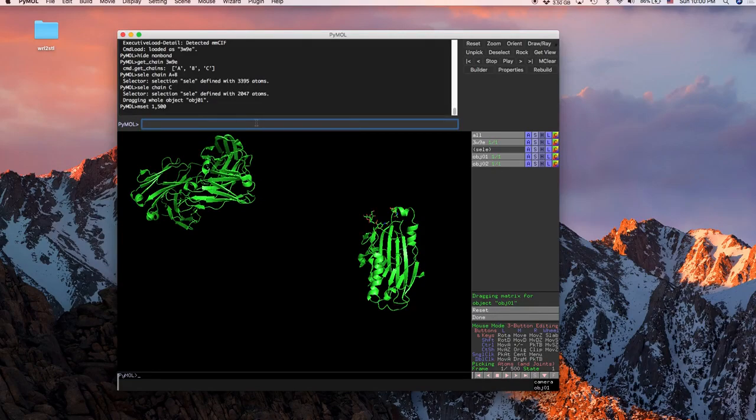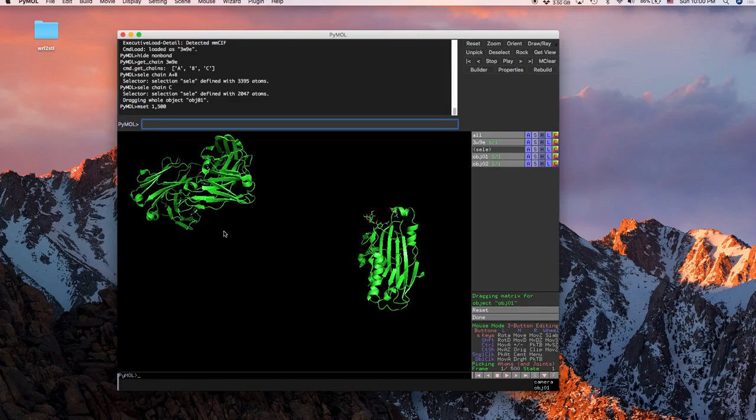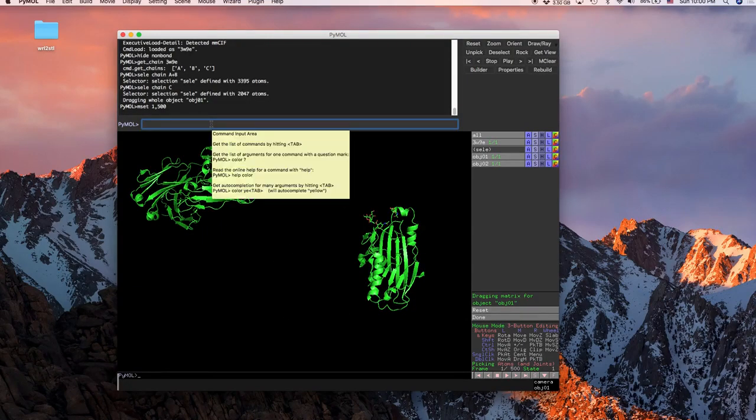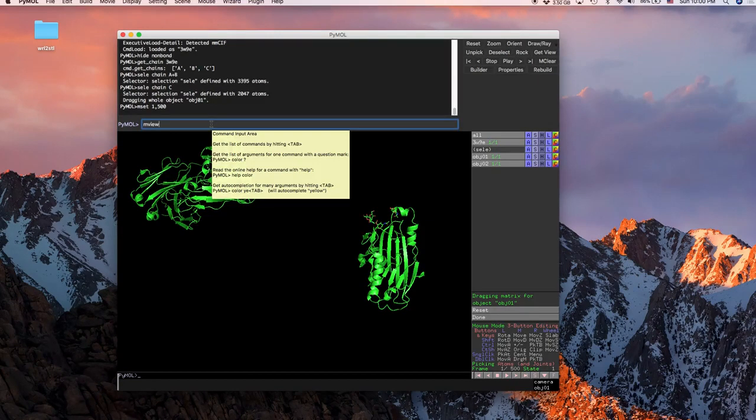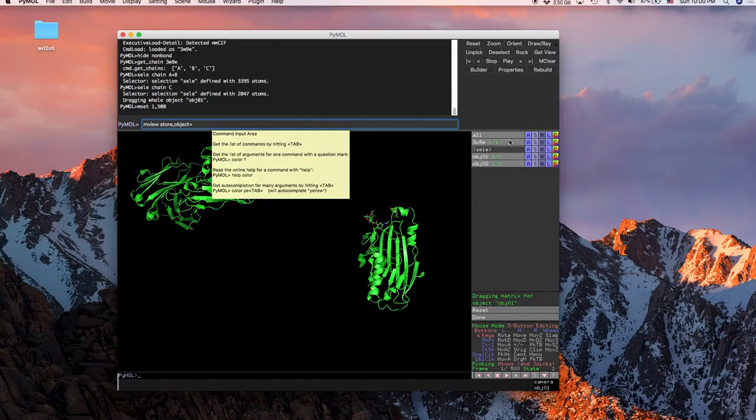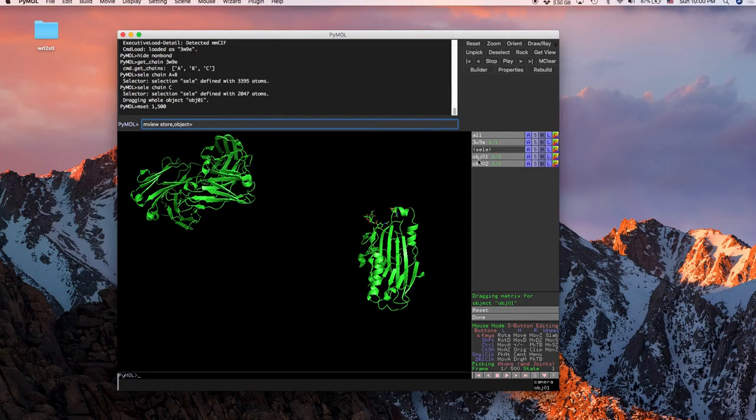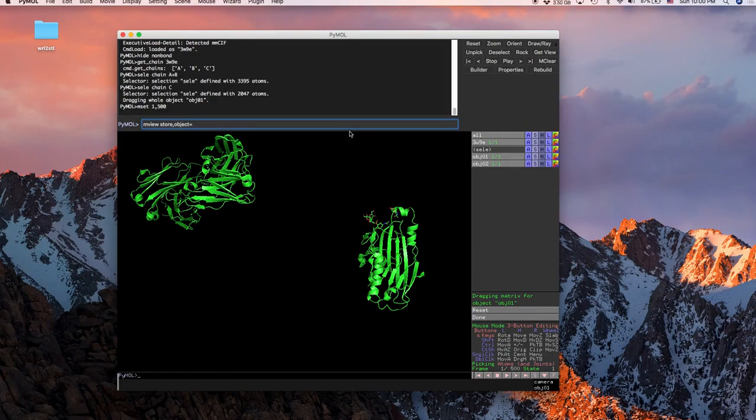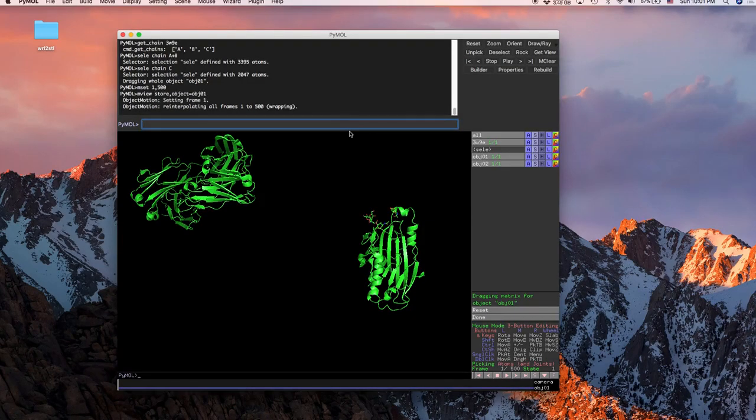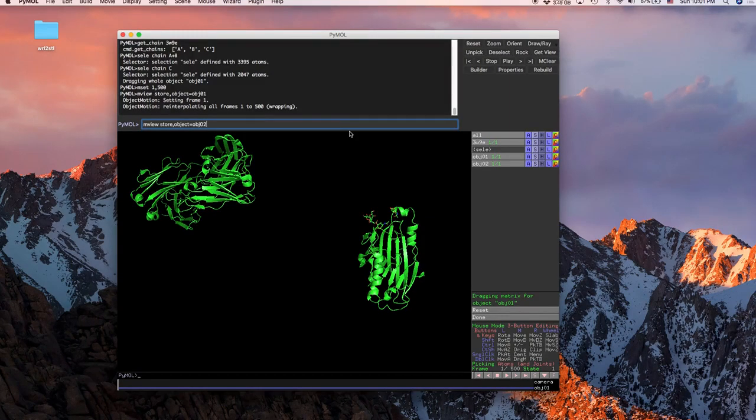From here we're going to have to kind of say where these objects are at which point in our movie. So right now we're automatically on frame one and this is where we want to start, so this is already here. So the next thing we're going to type, we're going to type in is mview, and we're going to do store comma object is equal, and then you're going to type in object one or obj01. And then you're going to do the same thing for the second one, so object 2.